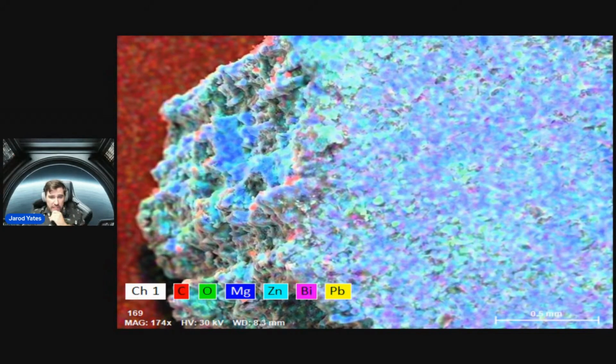You can see the bismuth all over this, but it seems like you can see all of that zinc poking out from underneath the bismuth, right? Because it's a really thin layer of bismuth, and we're turned to maximum brightness, maximum penetration depth of the light at 30 kV. You can see we got some oxidation going on. And specifically, there's a couple of spots here where you get a little bit of lead action going on. A little harder to see because it's so bright, but yeah, it's all there.